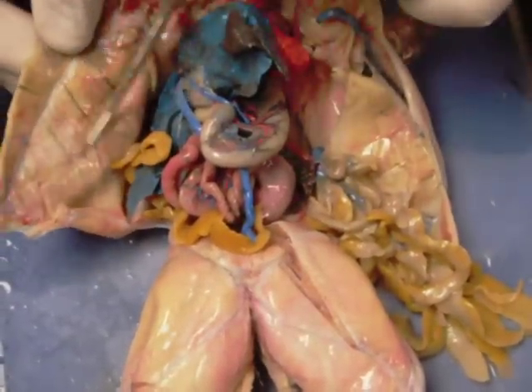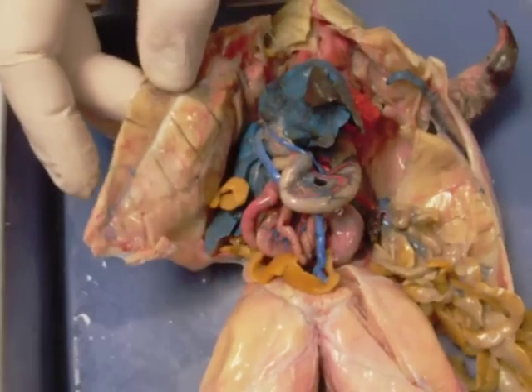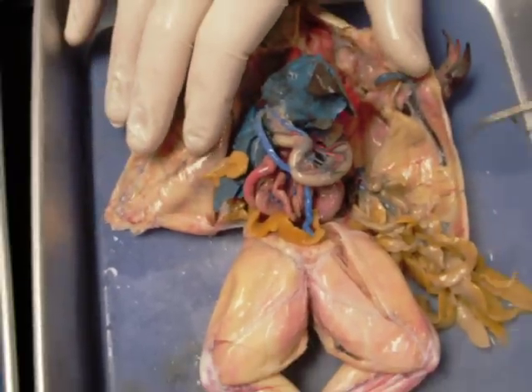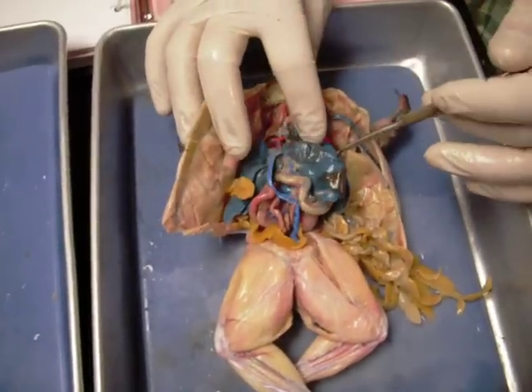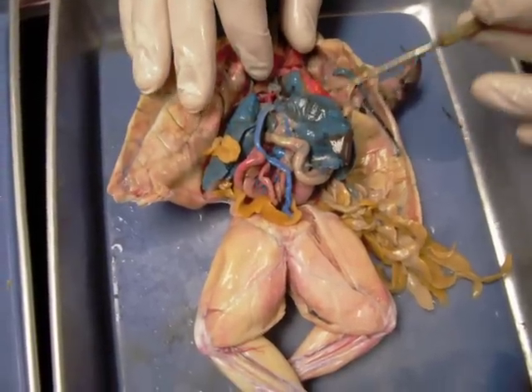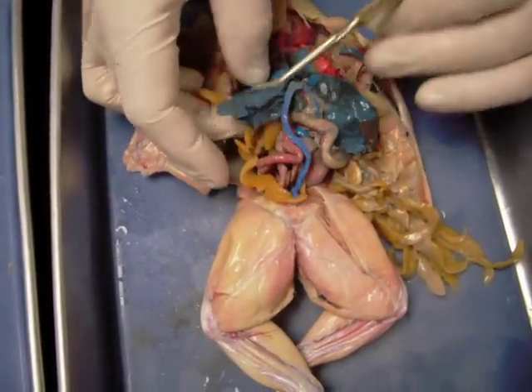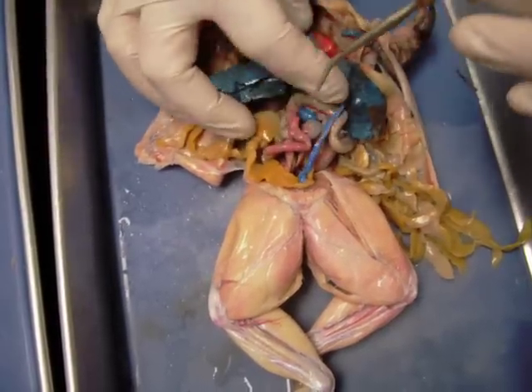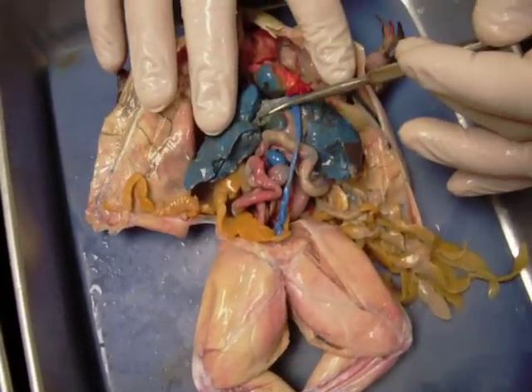This shiny surface on the inside is there not only because it's wet, but because there's also a membrane there. That membrane is called the peritoneum — specifically the parietal peritoneum. Another large structure that we see is the liver. It's taken some of the blue latex injected into the specimen, so much of it has gone to the liver. Here we have three different lobes of the liver, and associated with the liver we have a storage organ called the gallbladder.